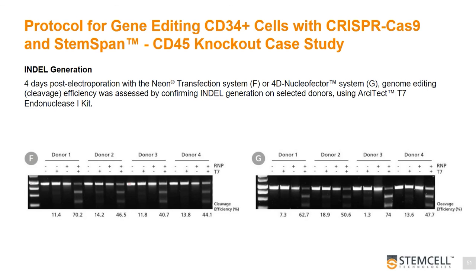We also perform T7 endonuclease 1 assay to confirm indel generation from the CD45 knockout experiments. Here we showed genome editing or cleavage efficiency of 4 donors at 4 days post-electroporation with the Neon transfection system, shown in figure F, or the Nucleofector system, shown in figure G. Depending on donor, you see here the cleavage efficiency was detected at around 44 to 70% by T7 assay.